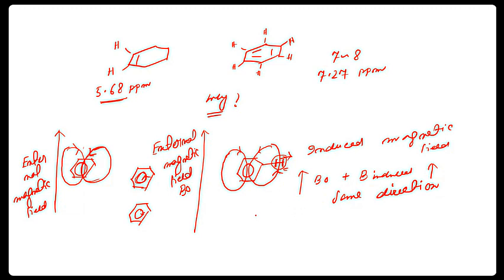Basically, now let us visualize what is happening. In presence of B0, let's say the two nuclear states separate this much. Because we have some induced magnetic field, now this separation will be quite higher. So this is for B0 plus B induced. Their separation will be larger. I didn't discuss the technique in detail, but believe me, if the separation becomes larger, then they will come to the higher ppm values.